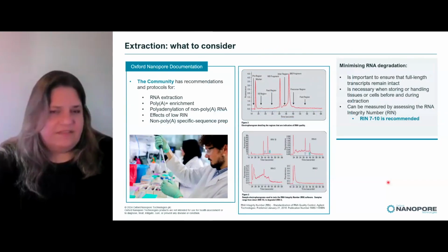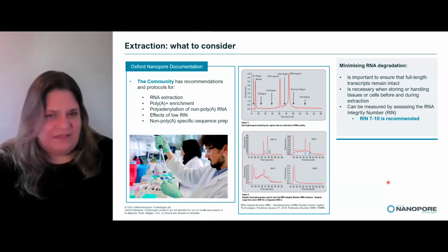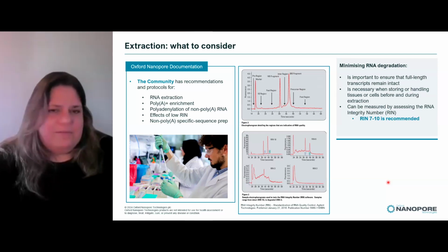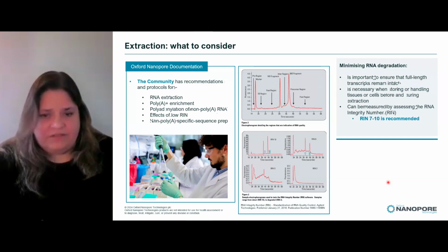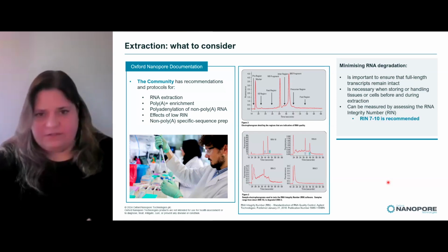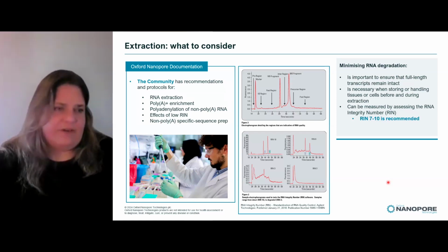So the things to consider when you're actually starting RNA work, which I think a lot of people can get quite scared about, but it's really not that scary. You just have to be a little bit meticulous. The one thing that you want to be very careful about is RNA degradation. If you're working with RNA, the big scary thing is whether or not you're going to introduce degradation, and that is through all the RNases that are present everywhere.